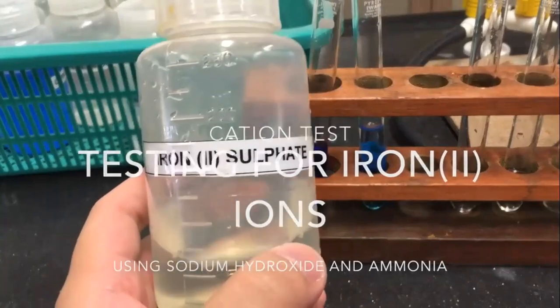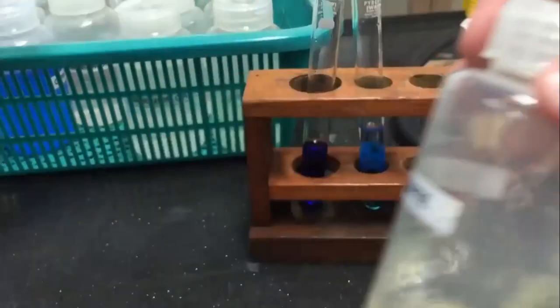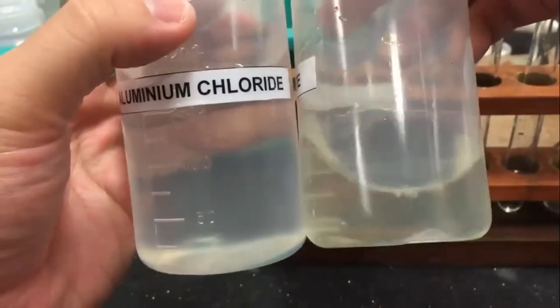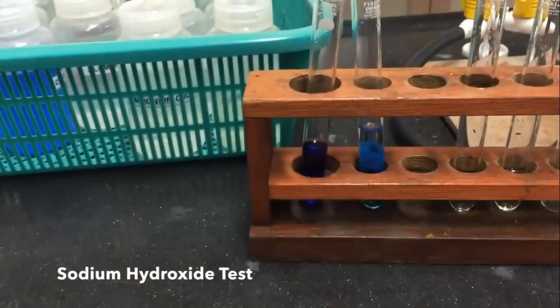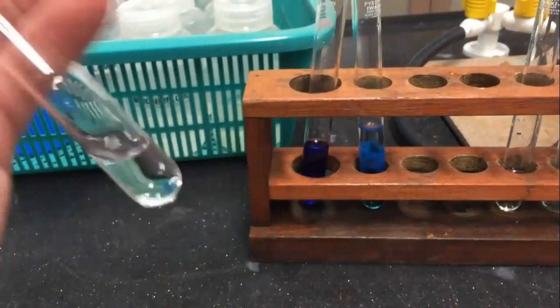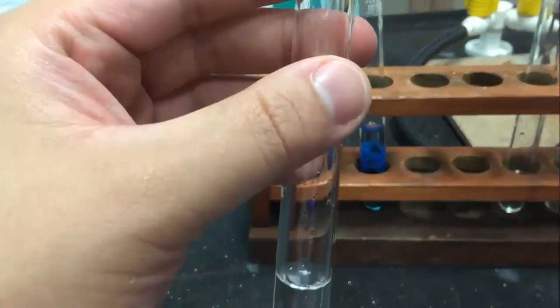Solutions containing iron 2 ions are typically pale green in color. Compare this iron 2 sulfate solution to a colorless solution like that of aluminum chloride. First off, we may use the sodium hydroxide test to test for the presence of iron 2 ions. To a small sample of a solution, add a few drops of sodium hydroxide solution.